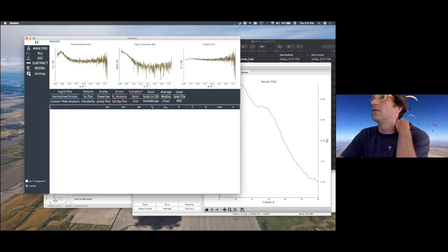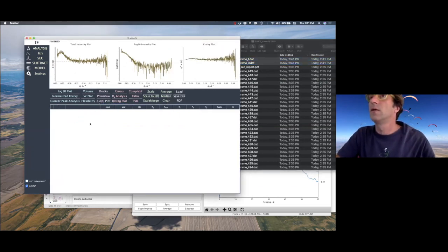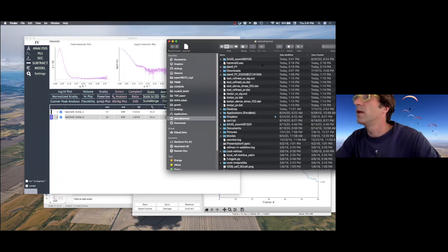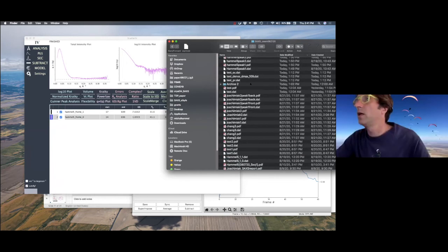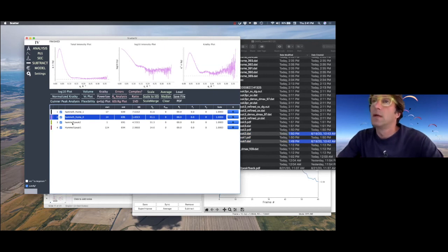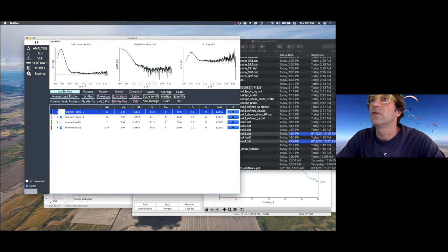So let's use the scatter again with component 1 and 2, and compare that with our simple merging and see how different those peaks are. That's peak 1 and 2. Let's compare peak 1 first.